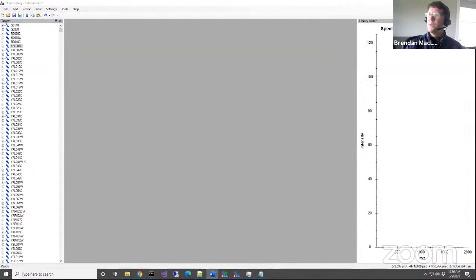And let's go. So yeah, that should leave you with a final count of 3,597 proteins, 38,000 peptides, 50,000 precursors. So these are lower numbers. In the paper they're like 80,000 and 60,000, and you can definitely go through things like using semi-tryptic and loosening things up, and you can get Skyline to have those 80,000 precursors and 60,000 peptides, but we're not doing that here. Everything has 6 transitions.